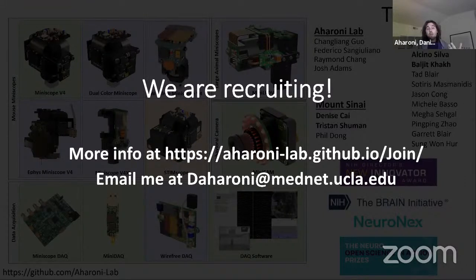For the recordings we've done, which are these 24-hour long recordings, we try to really make sure everything is optimized in the system to use as low power as possible. And with our newest recordings, we actually hit the bottom of the LED drivers we use. We hit the default LED leakage current, and we can still slightly over-brighten for what we want. But that's solvable.